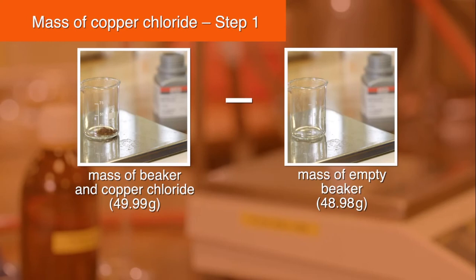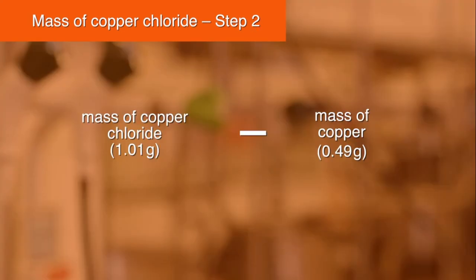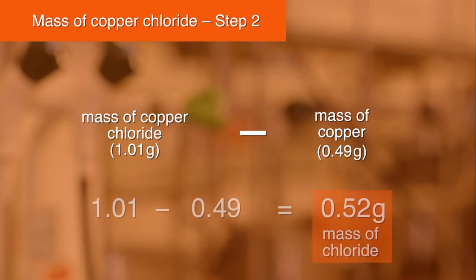First, the mass of the empty beaker is subtracted from the mass of the beaker containing the anhydrous copper chloride. Then, the mass of copper produced, calculated earlier, is subtracted from the mass of the anhydrous copper chloride. This gives the mass of chloride.